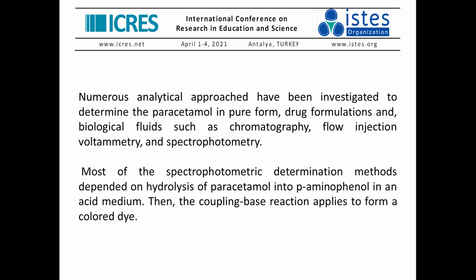Researchers before used methods such as chromatography, flow injection, or even voltammetry. However, today I'm talking about a new spectrophotometric method for determination of paracetamol in drug formula and in pure form.